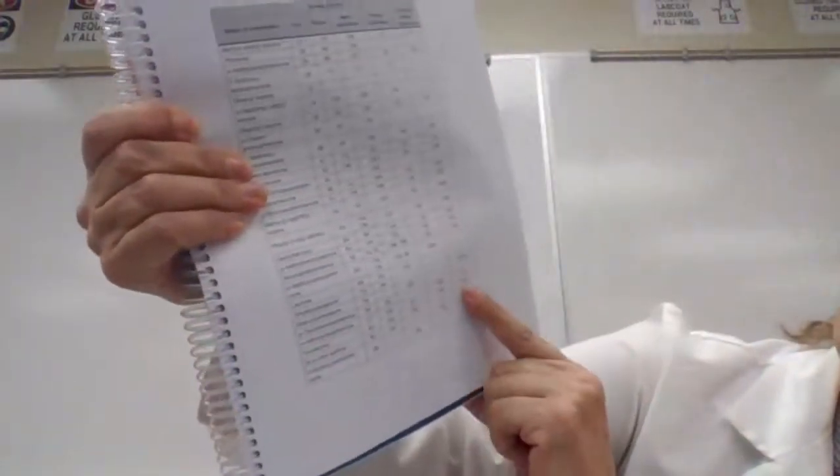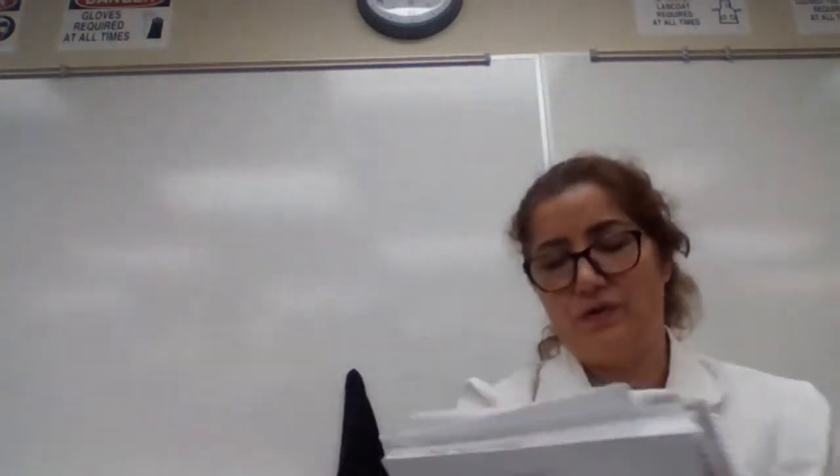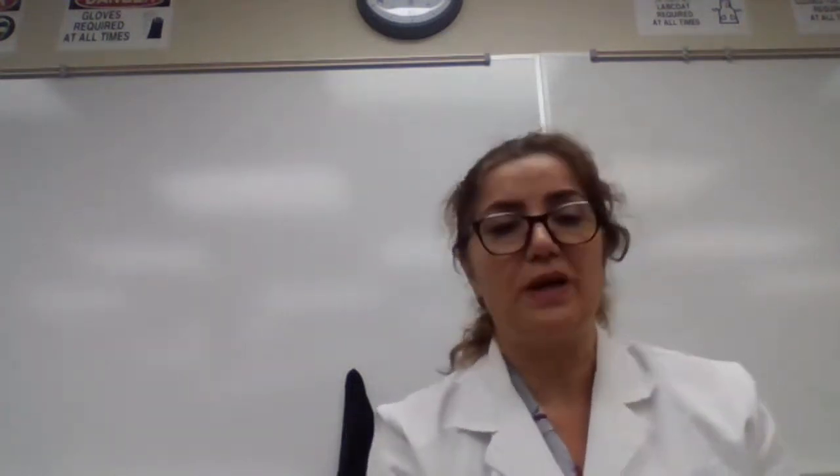Because you have two compounds very close, you could make the dinitrophenylhydrazone, the phenylhydrazine derivative of that compound. Basically you mix your unknown with the reagent and get a precipitate. You dry that precipitate and measure the melting point. If it's 185, it's going to be chlorobenzophenone, and if it's 228, it's going to be nitroacetophenone. So you can use the chart to decide which derivative you should pick and which reagent you should add.